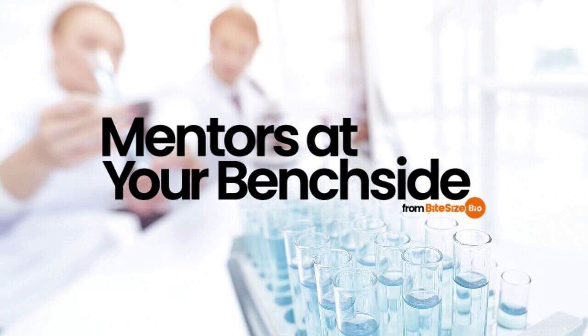So what is a good yield for plasmid preps? There are three main types of plasmid preps: mini, midi, and maxi. The amount of plasmid DNA varies between protocols and kits, but as a rough guide, the average range for a mini prep is 5 to 50 micrograms, 50 to 200 micrograms for a midi prep, and between 200 and 1,000 micrograms for a maxi prep.